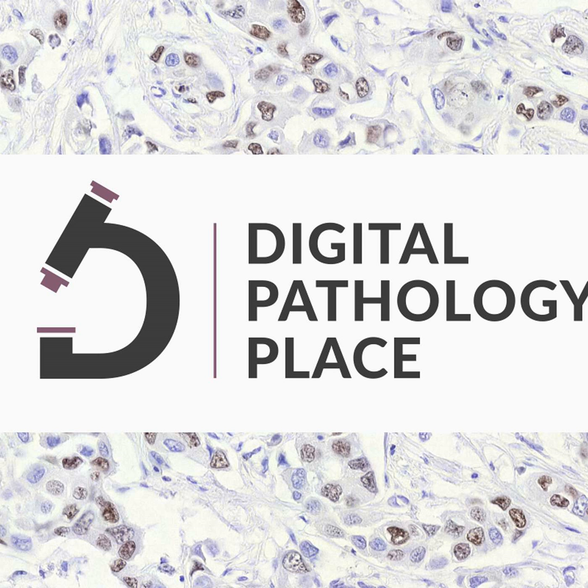But if you want to take it to the next level across different modalities, like sequencing reports, surgical reports, pathology, and all the way up to information that gets to patients. If a patient has trouble understanding a pathology report, they will probably paste it into ChatGPT and ask what it is. Most of the time they will get an answer, but why do they need to do it? That is the information about their health, and they should not have to decipher it.